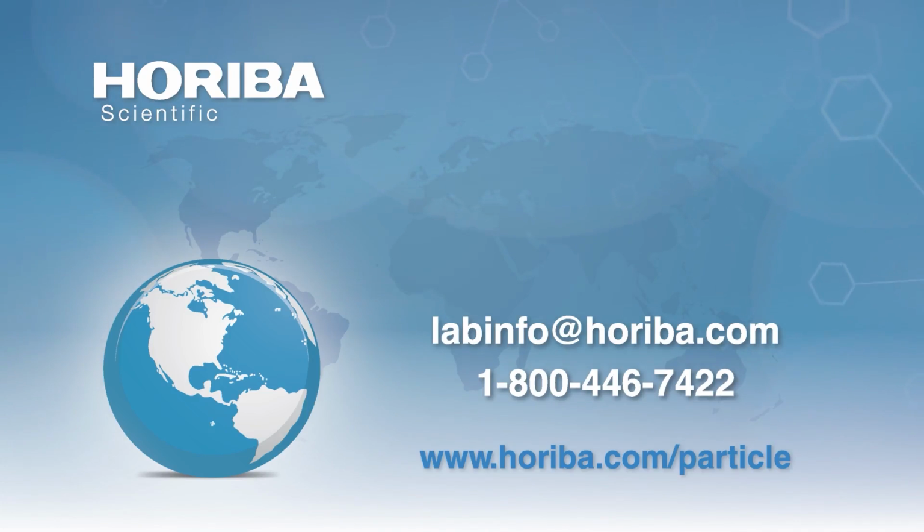So the other thing you can do is a dilution step, if you feel comfortable with that. Some people feel that when you make a dilution, there's always a possibility you might cause things to agglomerate or otherwise the size to change. So that's the risk you run with dilution. But if you have a relatively stable emulsion, you may have an opportunity to do that without affecting the size.